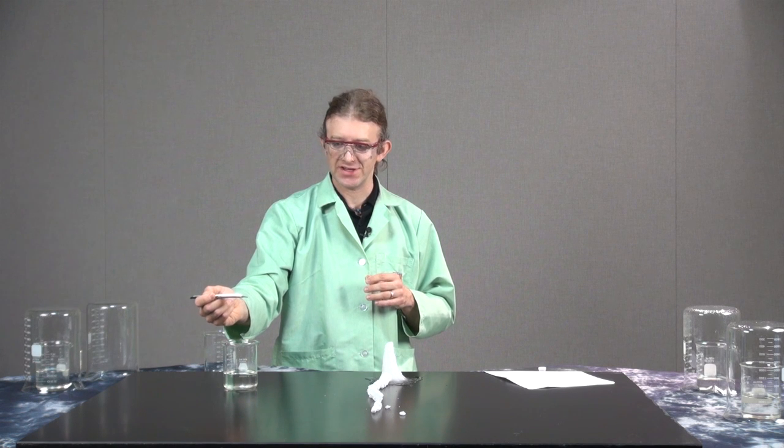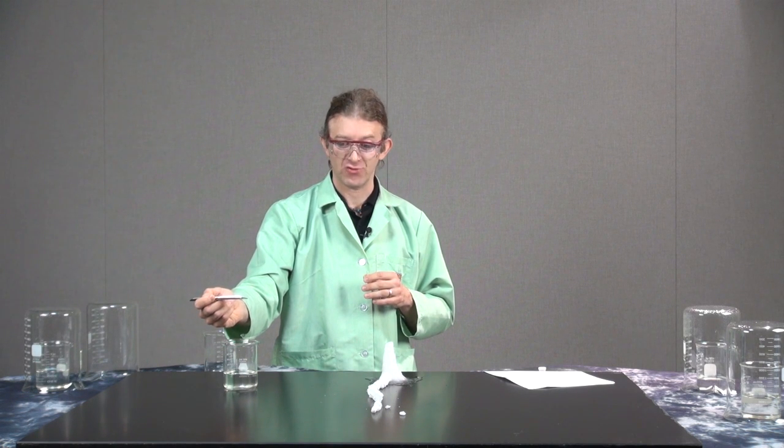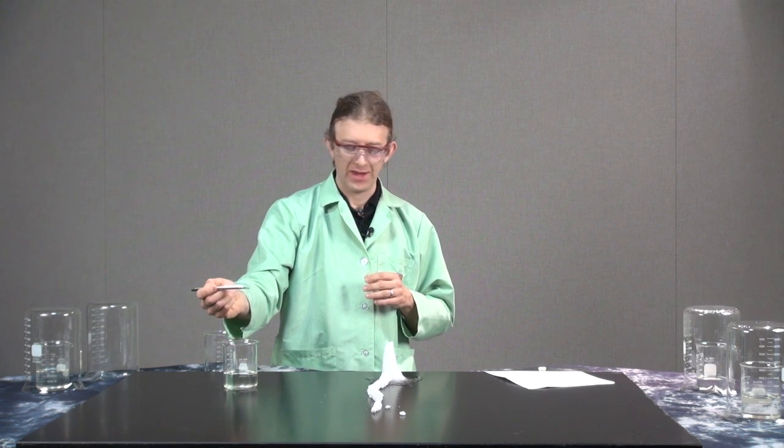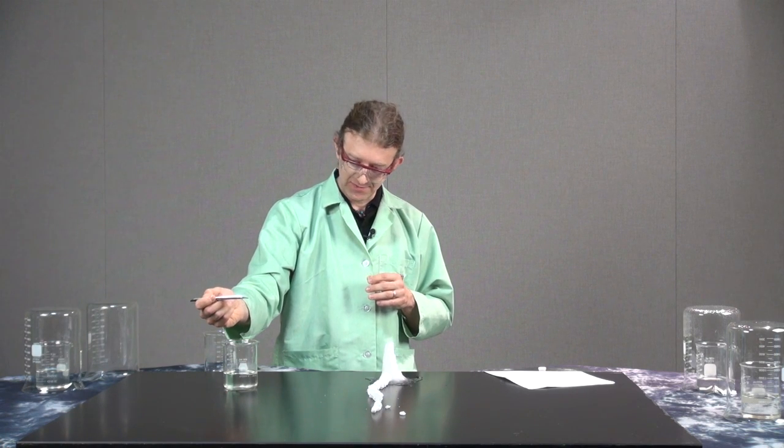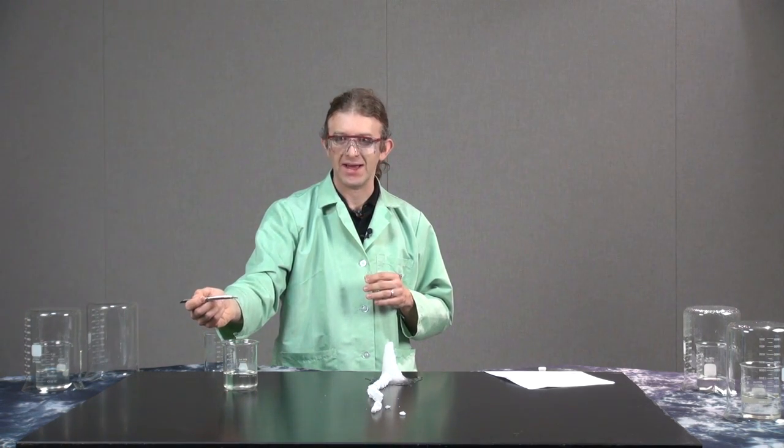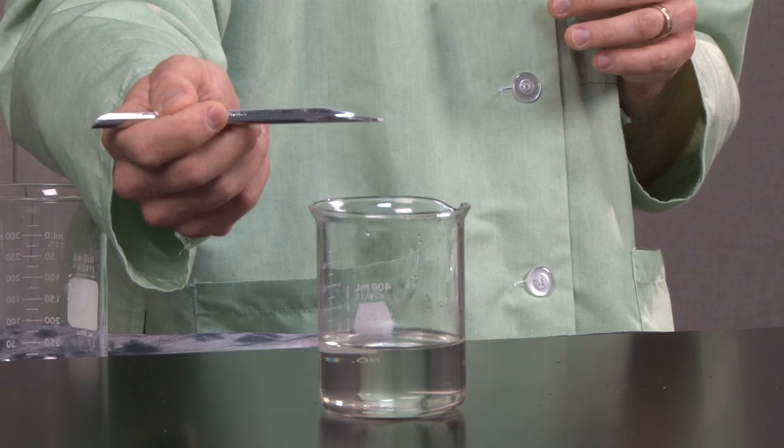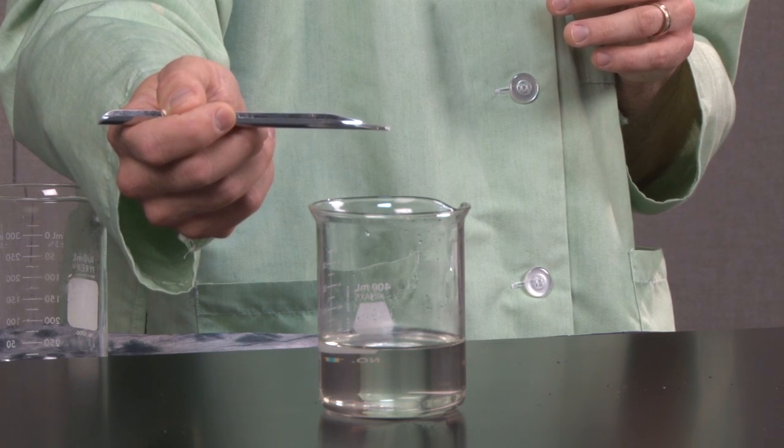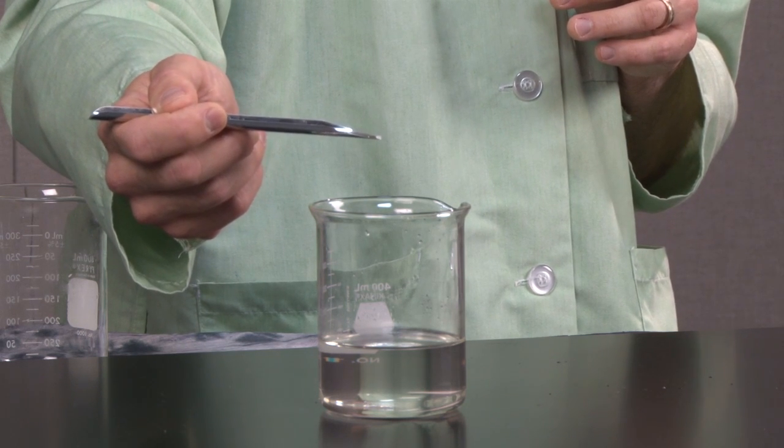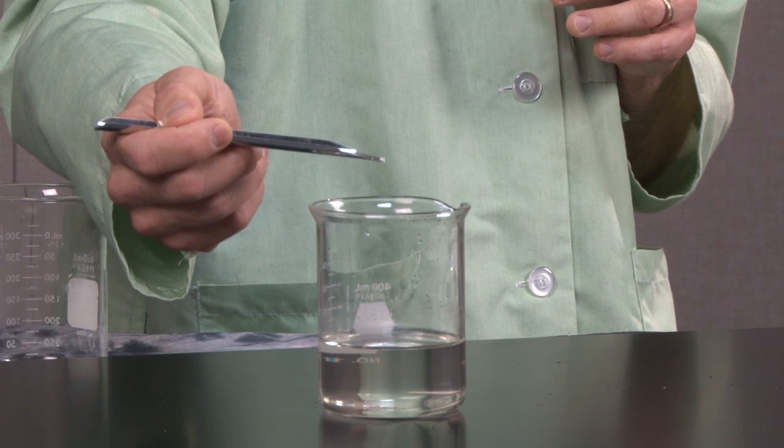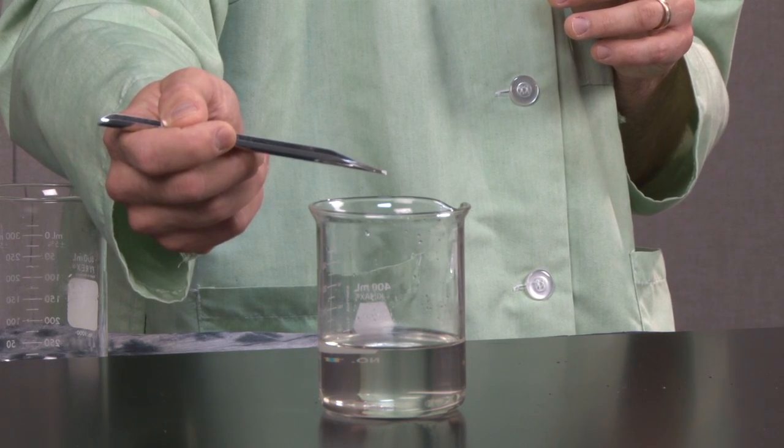So we just saw a demonstration where we made a sodium acetate trihydrate column. And we're going to try to crystallize this next supersaturated solution by dropping a seed crystal in. So I have a seed crystal on the end of my spatula here. I'm going to drop it in and hopefully it will start the crystallization process. Here we go.